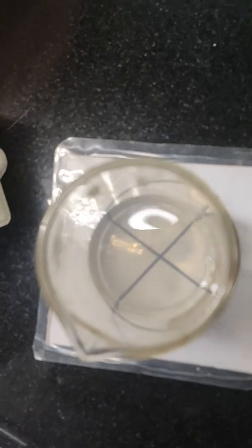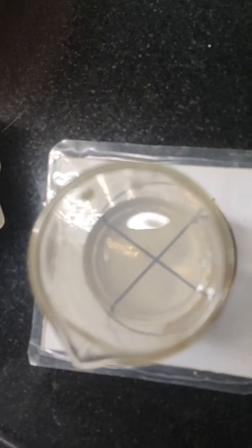You can see, students, now the solution has started becoming turbid, and as the time passes it will become more and more turbid, and after some time these marks will disappear.